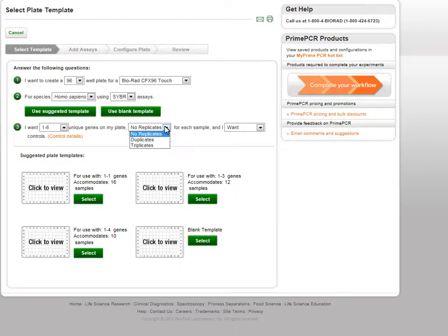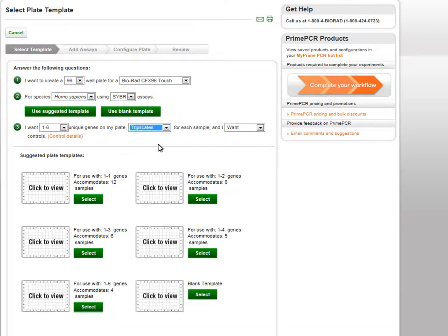Next, select the number of replicate assays you would like in each sample. Templates are only available for single, duplicate, and triplicate assays. If you would like more than triplicate assays, you will need to use a blank template.